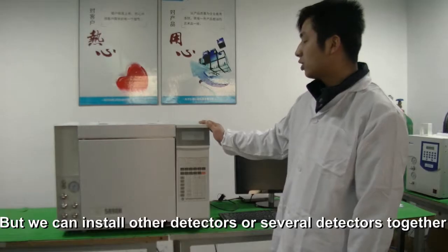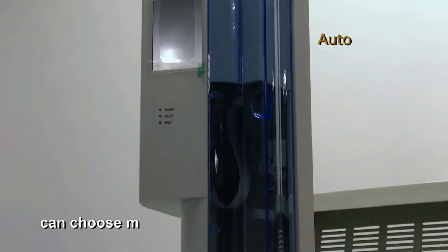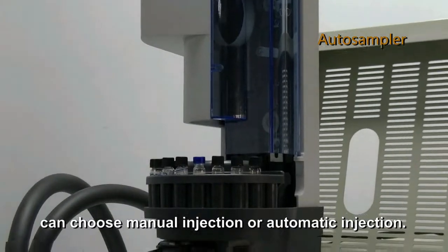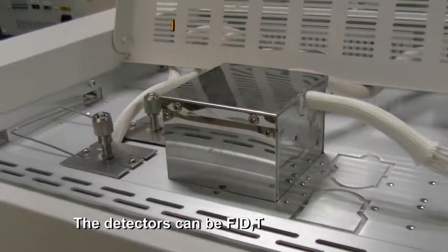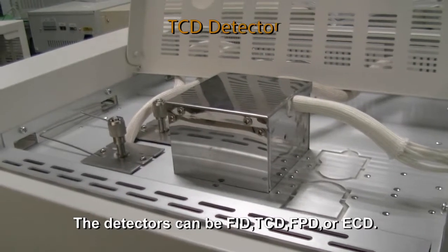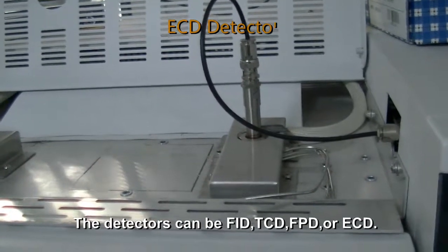We can install other detectors or several detectors together according to customer requirements in the application. We can choose valve injection or automatic injection. The detectors can be FID, TCD, FPD, or ECD.